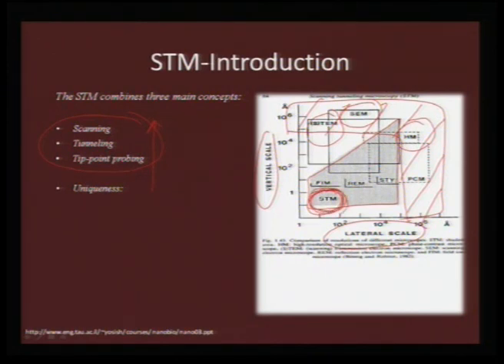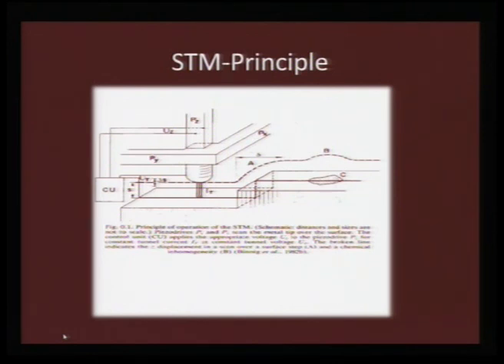So in comparison to SEM and TEM and other microscopy, STM stands out because you're almost taking it near to atomic resolution. So, what is the principle here?